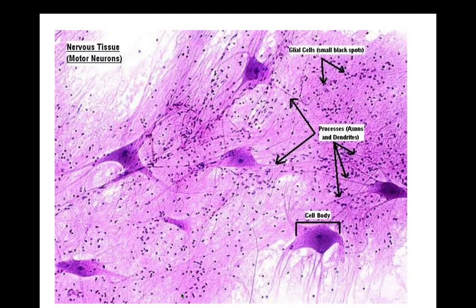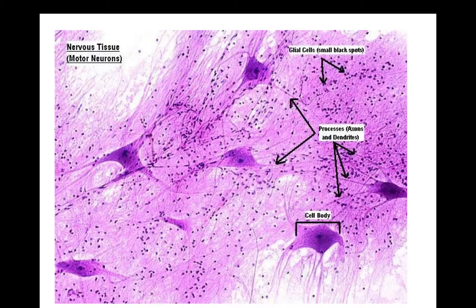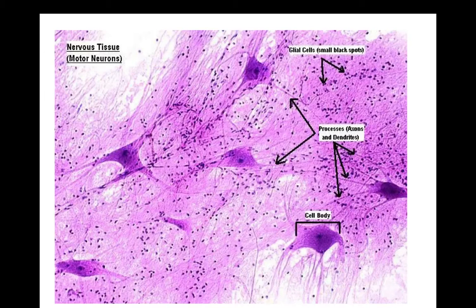Hi class, we're going to be doing a little video on nervous system histology. Some of these photos you're going to see are taken from our class microscopes — some of our students took some great pictures — and some pictures are just pulled from the web, just to give you an idea of what you need to look for.